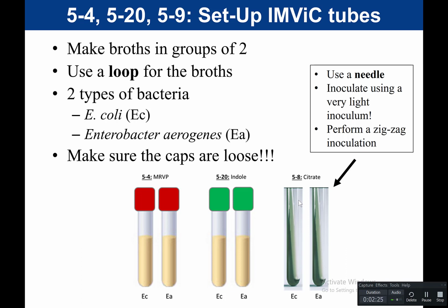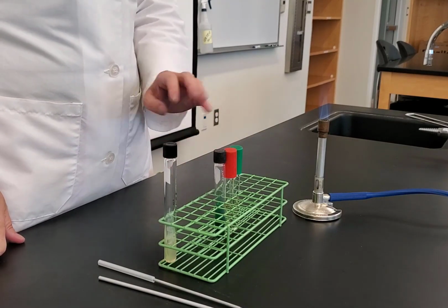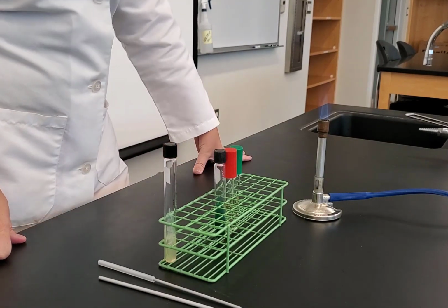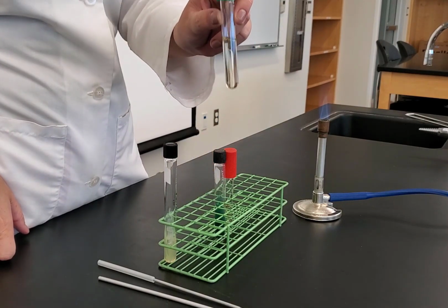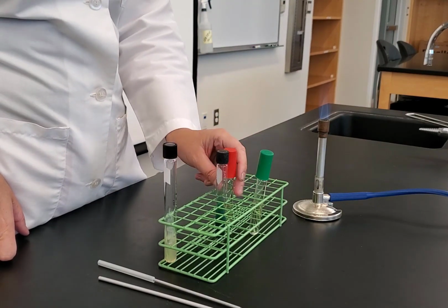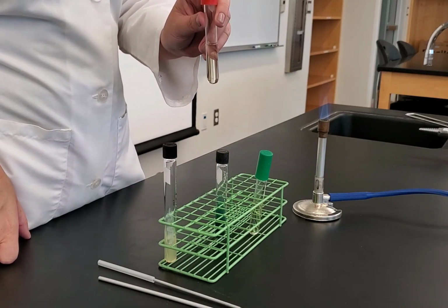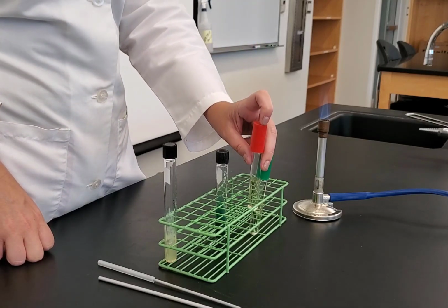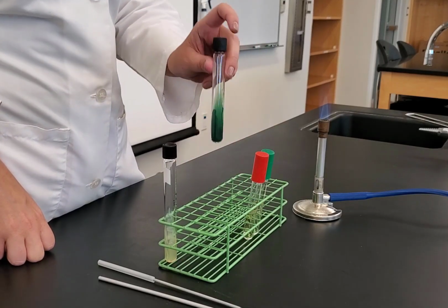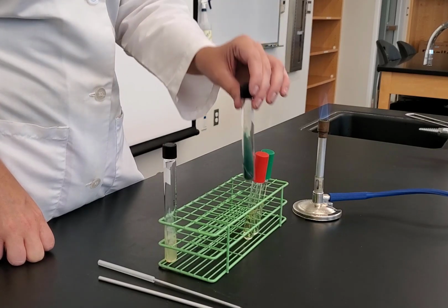So now I have a video demonstrating the setup for these tubes. So in this experiment, I'm going to demonstrate how to set up our IMViC. IMViC stands for indole. So we have an indole production test. We have the MR, methyl red. V, Voges-Proskauer, that's in the same broth. This is an MRVP broth. And then the C is citrate. This is a citrate slant. We're looking at citrate utilization.